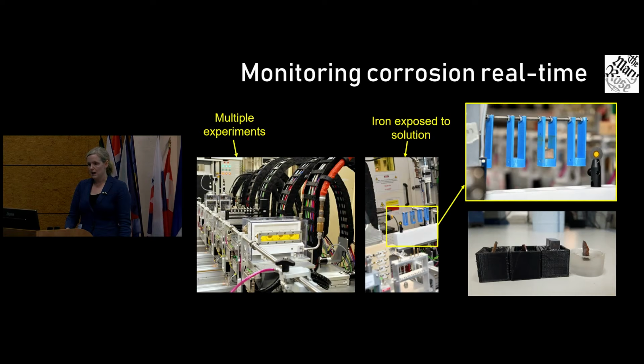And then the last experiment that we've been doing on the iron is on I-11 at Diamond. They have a back hutch, which is for long duration experiments. We've been running this for well over a year. Here you see robotic arms, and there's a whole range of different experiments. They have every Monday blocked out, when they put each of those experiments in the beamline and run X-ray diffraction on them. We set up an experiment looking at Mary Rose iron, some freshly excavated marine archaeological iron, some modern day equivalent iron, and also some synthetic akaganeite. We put it into a solution which is typically used as a passive solution for looking after these kinds of materials, and every week we've been collecting diffraction patterns.